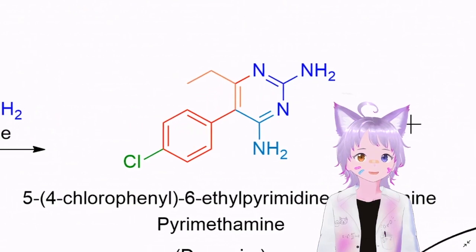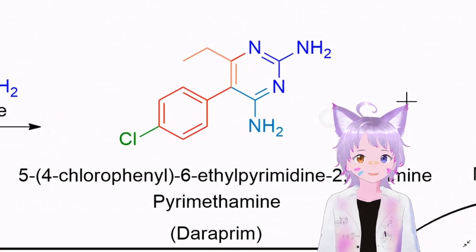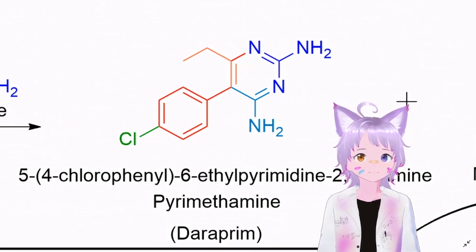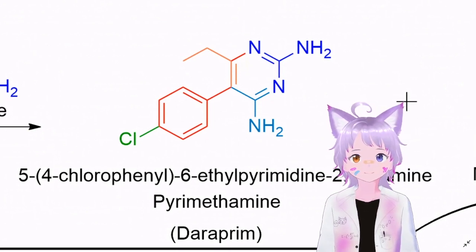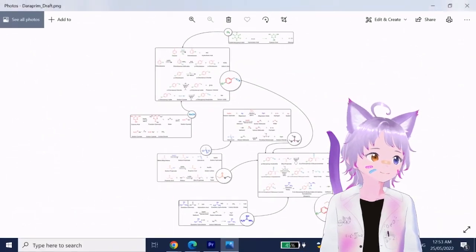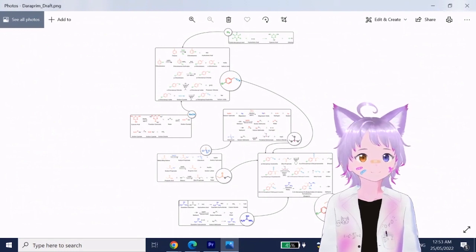So yeah, that's one possible way for you to get magnesium metal. It might not be pure, but it will be pure enough to use in the synthesis. And since you know how much aluminum you added exactly, you can put that into the calculation of the requirement of magnesium in order to do the synthesis, if you want it to be exactly how he did it in the video.